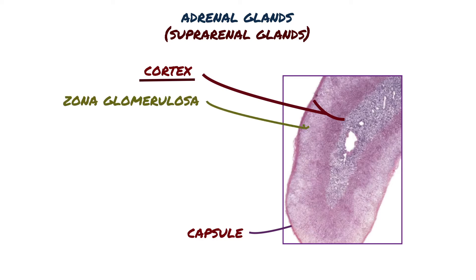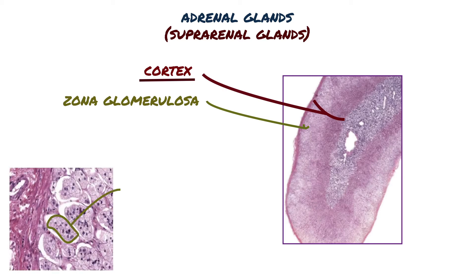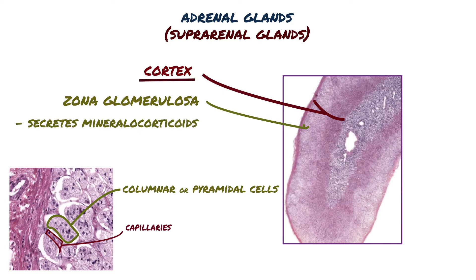The zona glomerulosa, immediately inside the capsule and comprising about 15% of the cortex, consists of closely packed, rounded or arched cords of columnar or pyramidal cells with many capillaries. The steroids made by these cells are called mineralocorticoids because they affect the uptake of sodium, potassium, and water by cells of renal tubules. The principal product is aldosterone, the major regulator of salt balance, which acts to stimulate sodium reabsorption in the distal convoluted tubules.